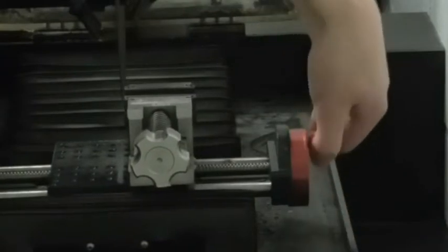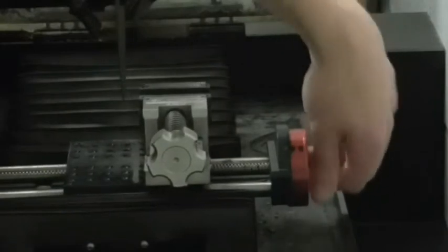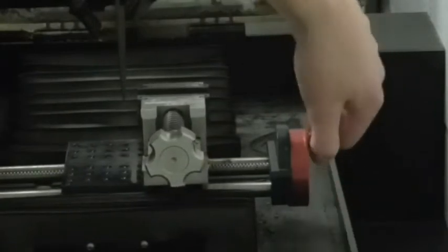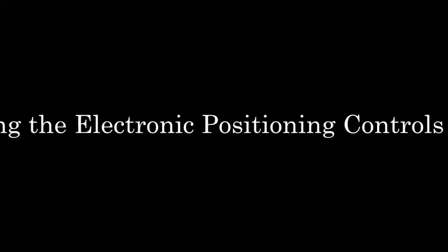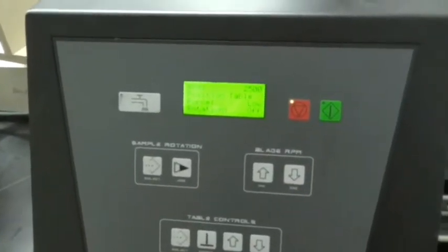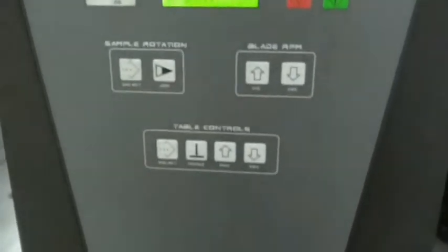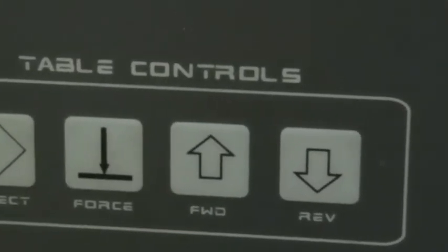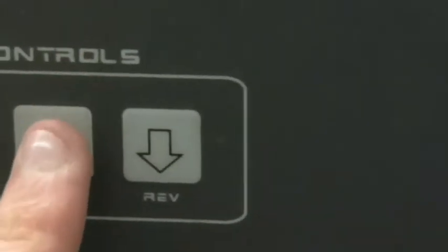This wheel turns a shaft in the bottom that moves the table left or right. What I'm going to show you here is how to adjust the table electronically. Under table controls, where it says forward and reverse, we are going to press forward.